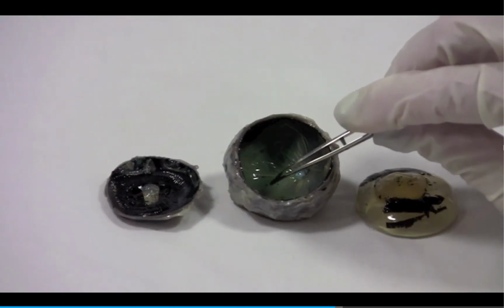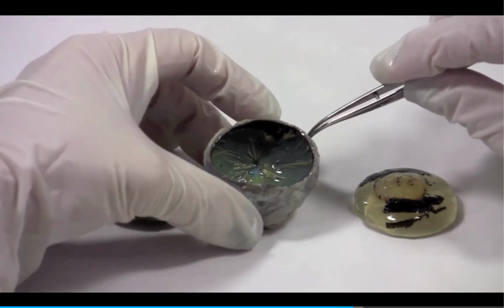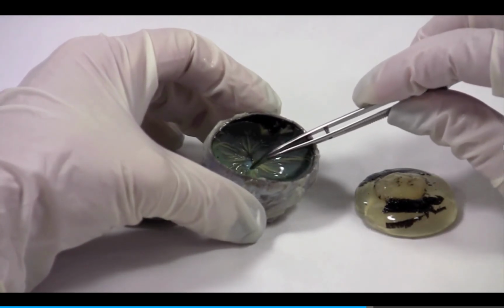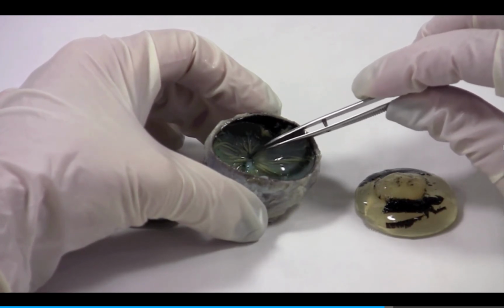The retina contains the optic disc, which is where axons from the retina leave the eye, forming the optic nerve, which is cranial nerve 2. The optic disc is known as the blind spot because photoreceptor cells aren't present here, and therefore visual information cannot be received in this area.